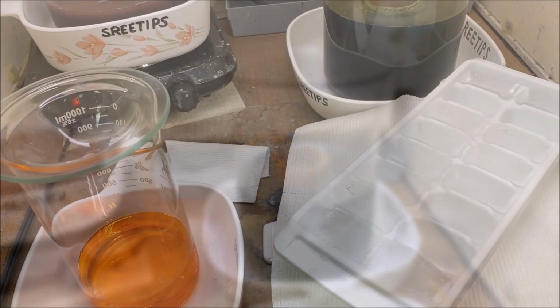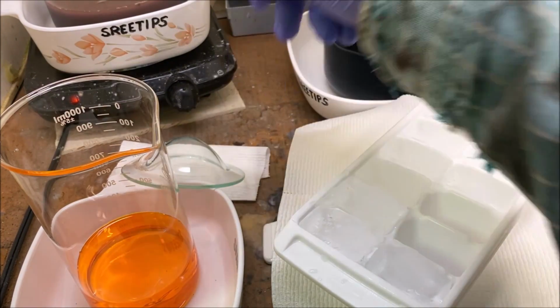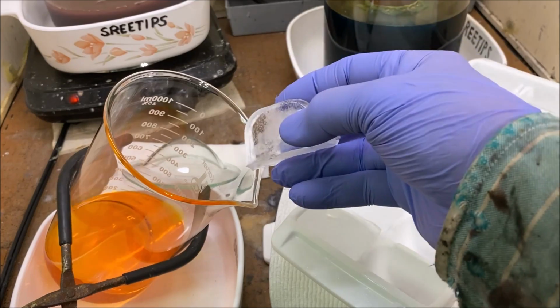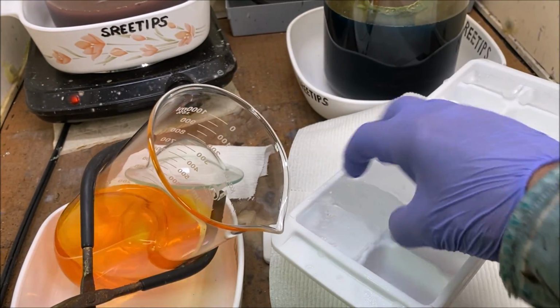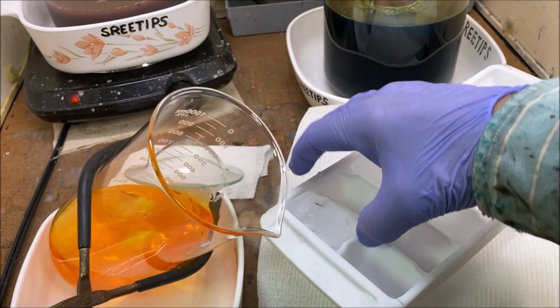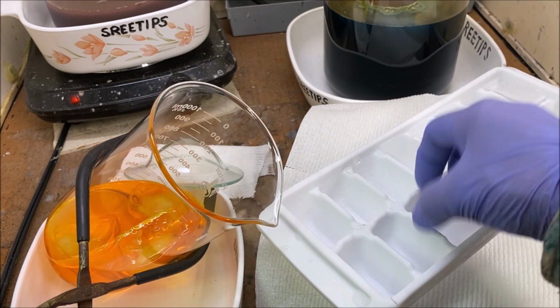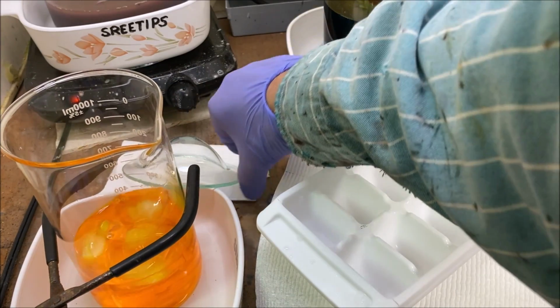I'm always searching for new ways to improve efficiency and safety and procedure and so forth. This is the best way I've found to get the ice in there. If you just drop it in, it might splash some of our gold out of there. And the best way to do it that I've found is just tilt the beaker with a pair of tongs and let those ice cubes slide down in there gently so we don't kick up any of the gold solution and lose it.